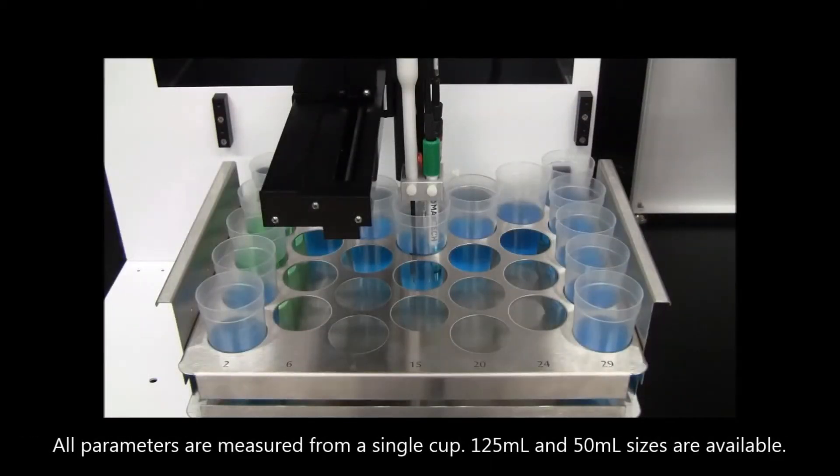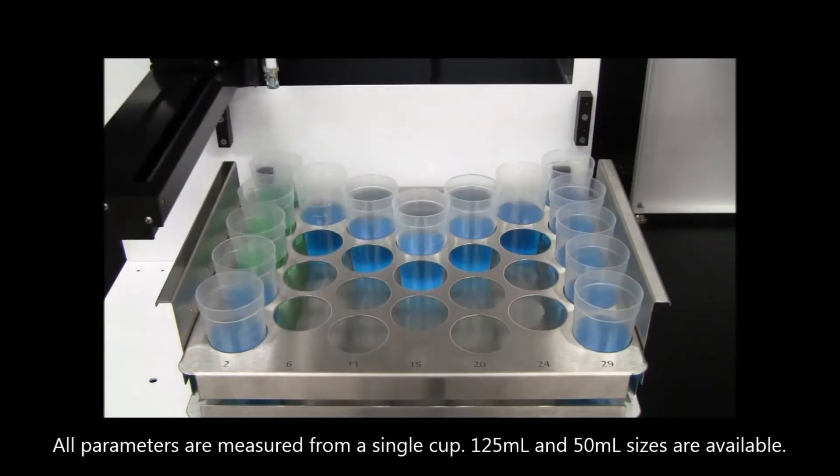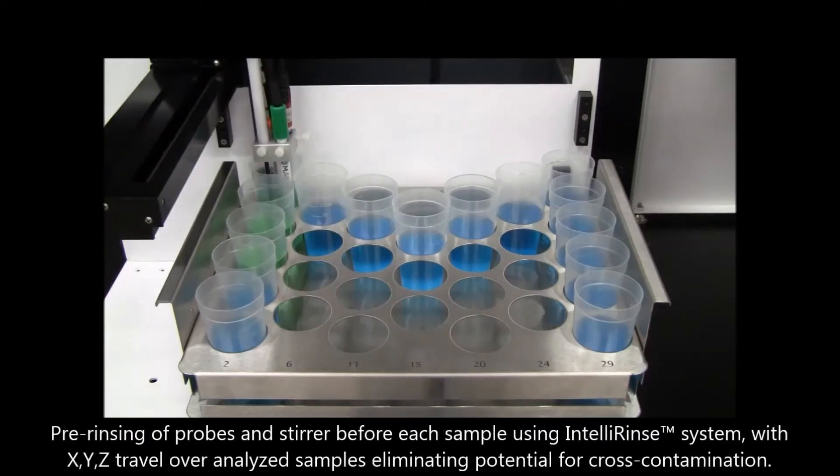All parameters are measured from a single cup. 125 and 50 mil sizes are available. Pre-rinsing of the probes and stirrer occurs before each sample using IntelliRinse.